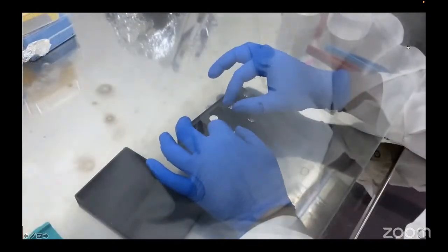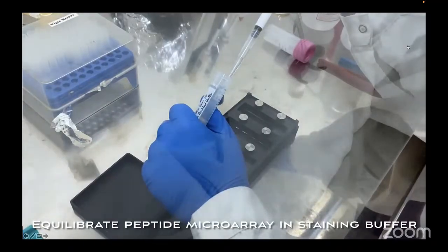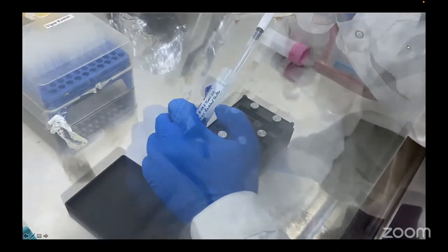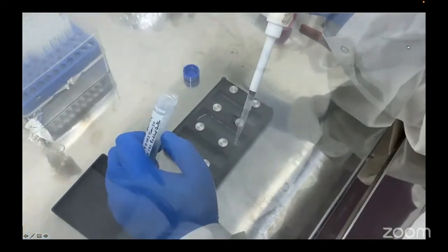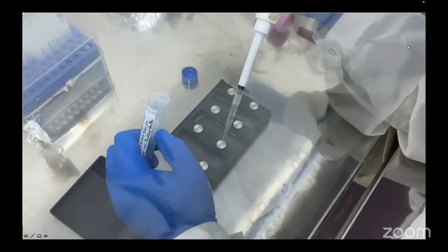Next, add 2 ml of staining buffer onto the chips. This step is called equilibration of the peptide microarray chip. Please note that we are not touching the microarray chip at any point. Now allow the equilibration process to happen for 15 minutes.